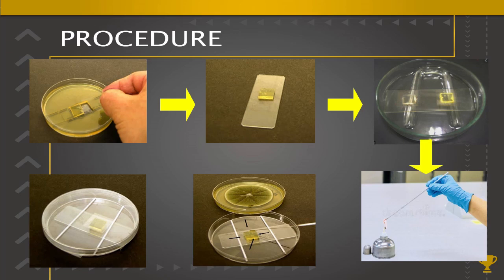And then using a sterilized bent inoculating wire, you can sterilize the inoculating bent wire by flaming on the spirit lamp. Then you take this bent wire and touch the fungal colony growth and then inoculate it on all the 4 sides of the agar block which you have taken and place it on the glass slide. After you inoculate all the 4 sides of the agar block, place a sterilized cover slip on top of it and then cover the lid of the Petri dish and incubate it.